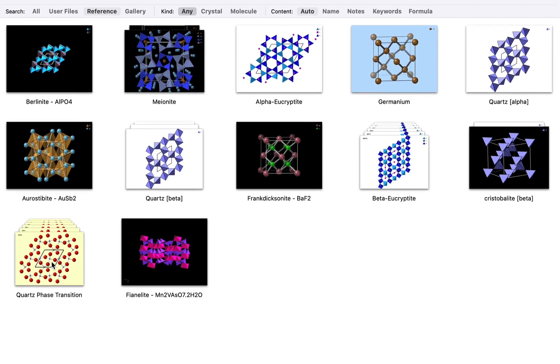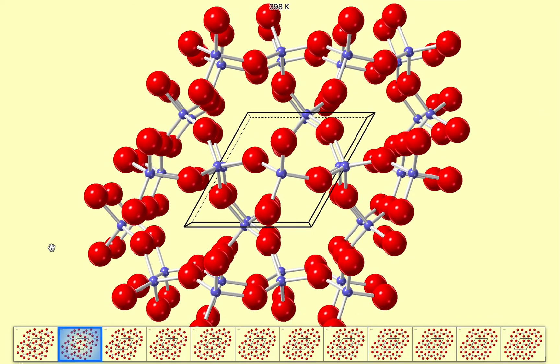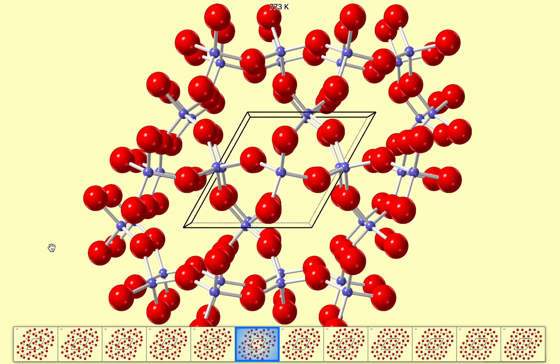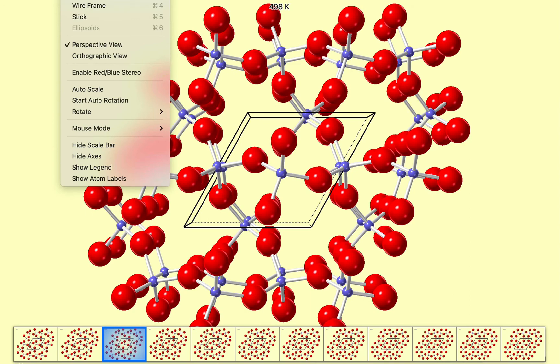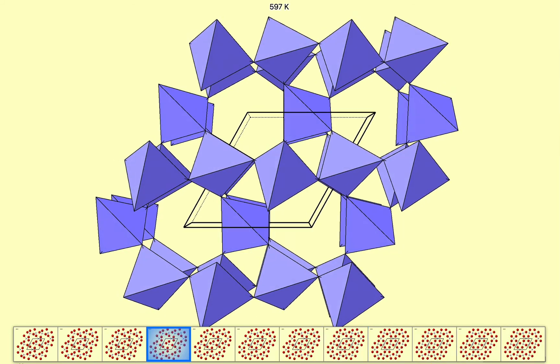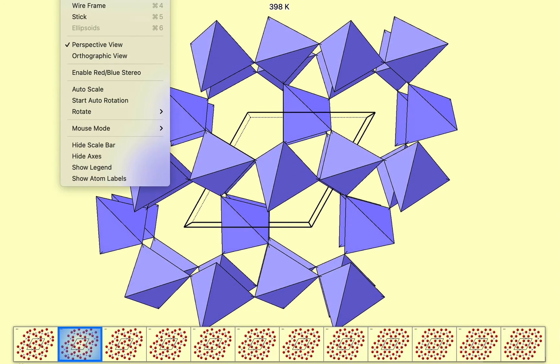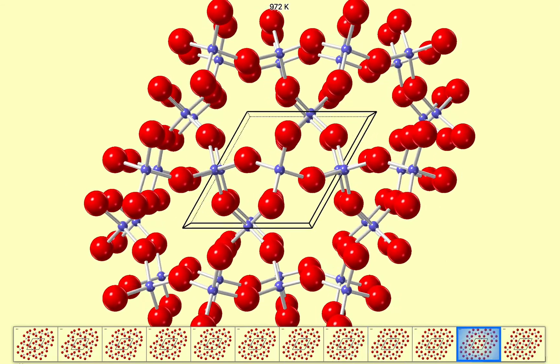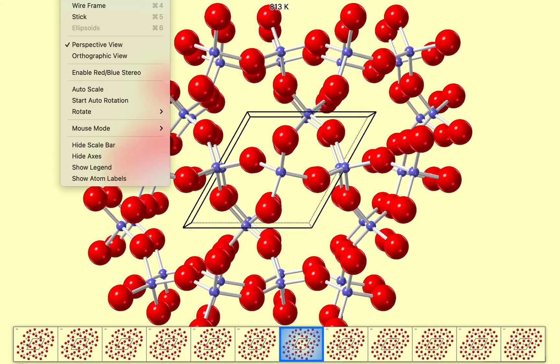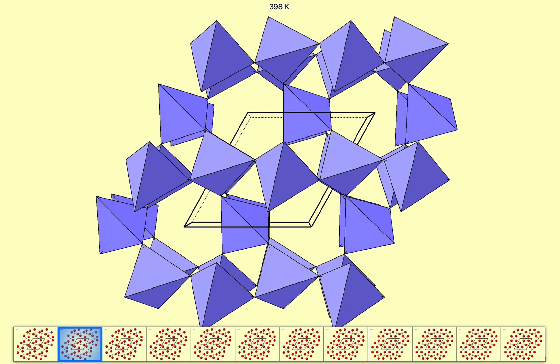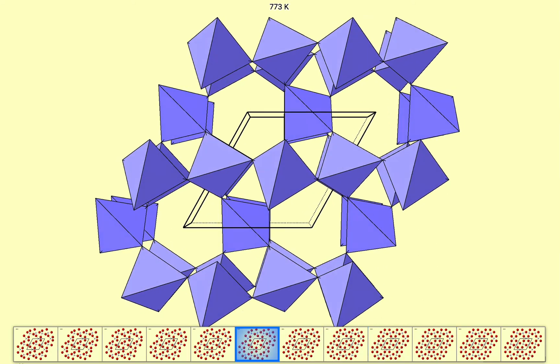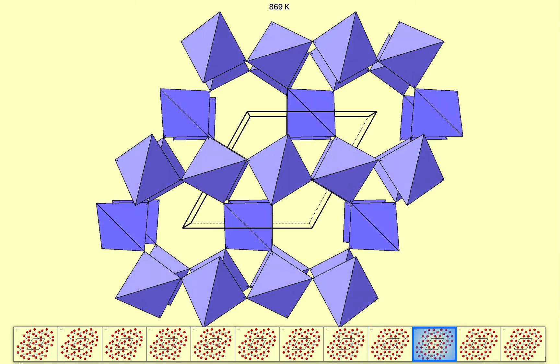Now we can see the structure animating. Let's change the model type to make it simpler. We'll go to the model menu and I'm going to choose a polyhedral model. So this is a simplified representation of the structure. This is very commonly used to complex structures where we want to replace a group of atoms, in this case four oxygen atoms around one silicon atom, a so-called silicate group, represent that by a three-dimensional shape, in this case a tetrahedron. And you can see how the structure changes with temperature and the symmetry is changing from three-fold to six-fold and then back down to three-fold and so on.